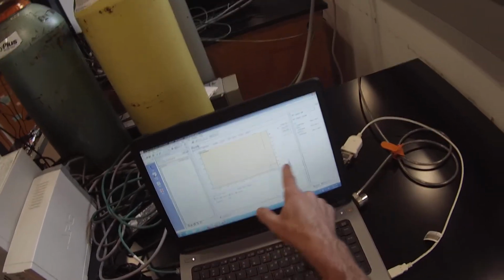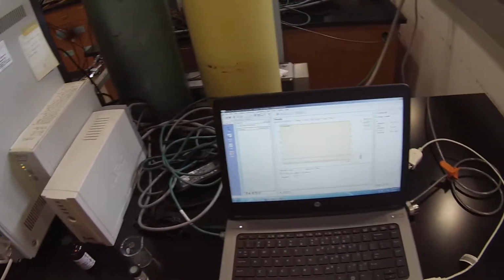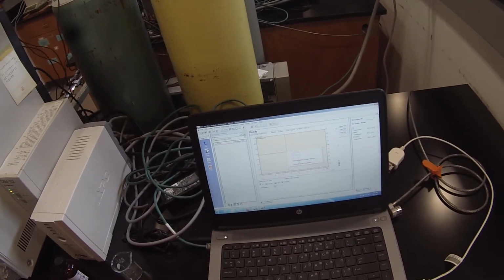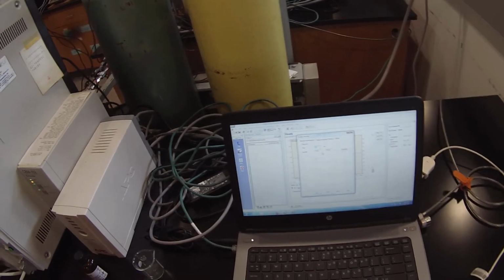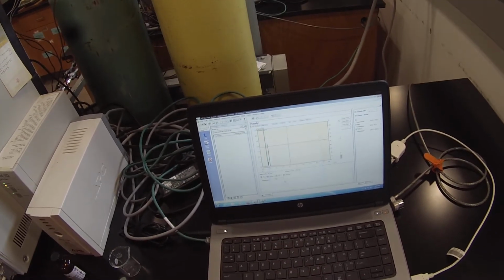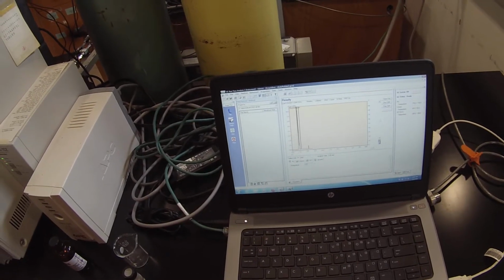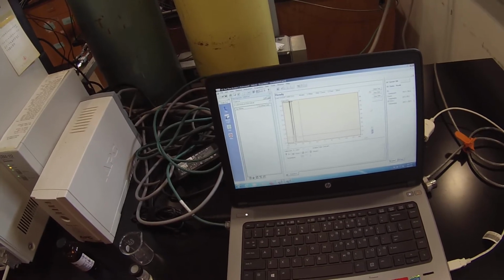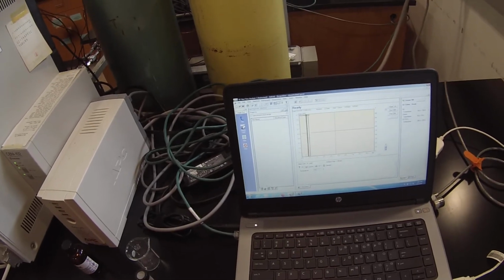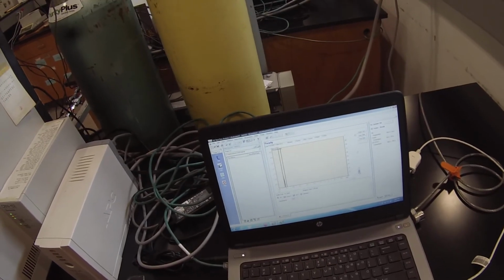The instrument's going to keep collecting data, even though it's no longer sending the data to the computer. So I can tell it that I actually want to see 10 minutes worth of sample here. It actually kind of looks like there's a second peak here that came off too late and wasn't detected. And I may need to do another injection and let this go for a little longer.